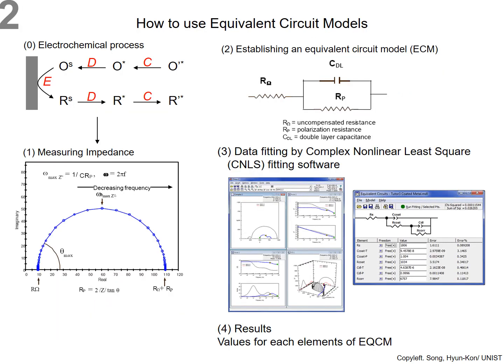We will use equivalent circuit models to quantify the parameters to explain your electrochemical processes. Here is the overview of how to use equivalent circuit models for quantification.